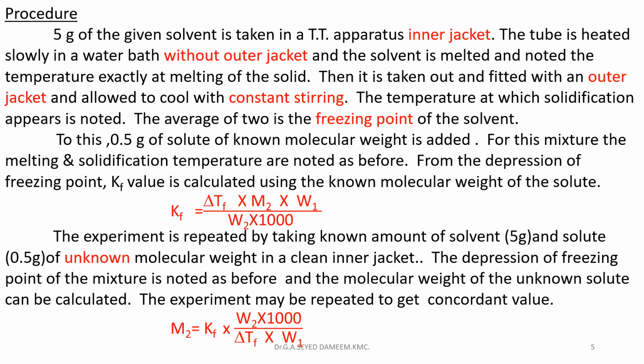For this mixture, the melting and solidification temperature are noted as before. From the depression of freezing point, the Kf value is calculated using the known molecular weight of the solute. From the formula, Kf is equal to delta Tf into M2 into W1 divided by W2 into 1000.